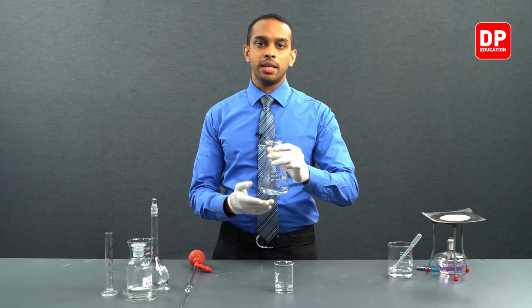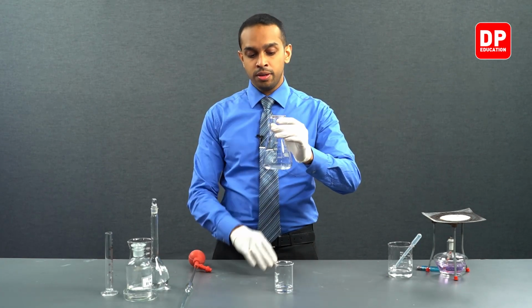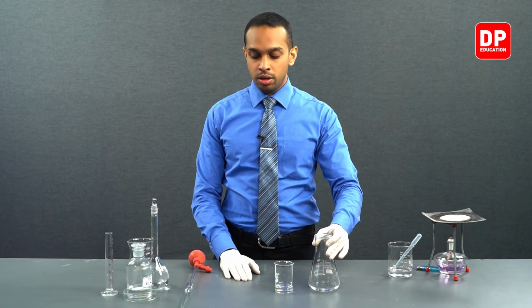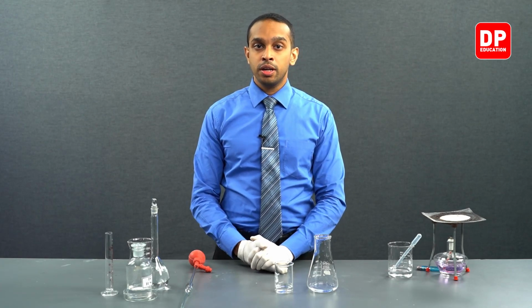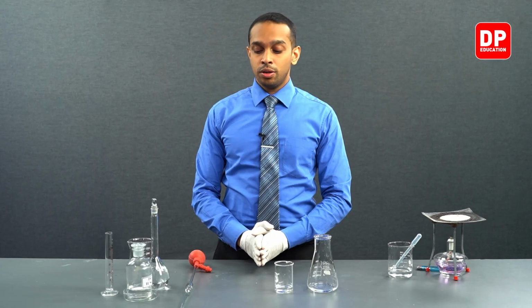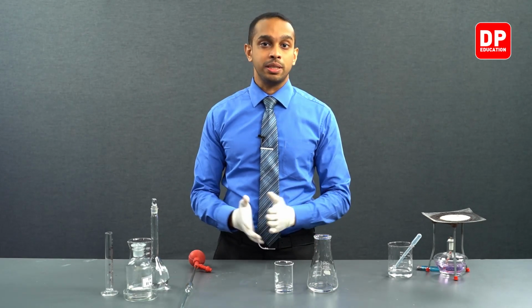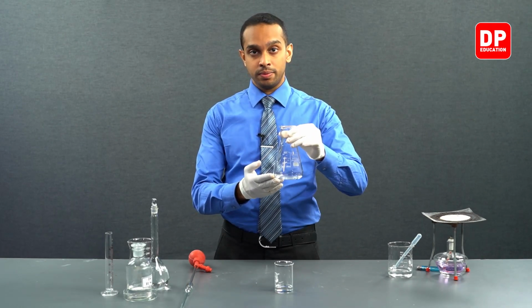After measuring exactly 25.00 cubic centimeters of our potassium oxalate solution, we have to add 15 cubic centimeters of dilute sulfuric acid. Now, when you are measuring the dilute sulfuric acid, we do not have to use a pipette, because we are titrating potassium oxalate.